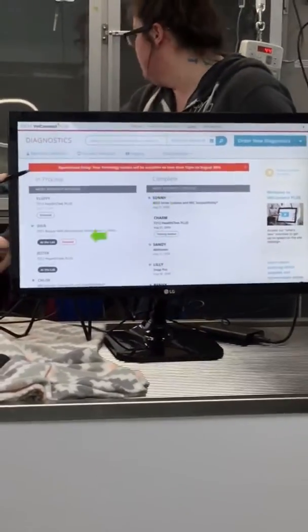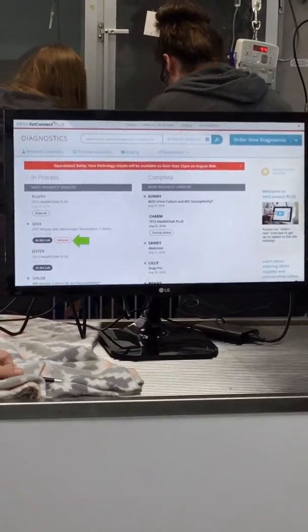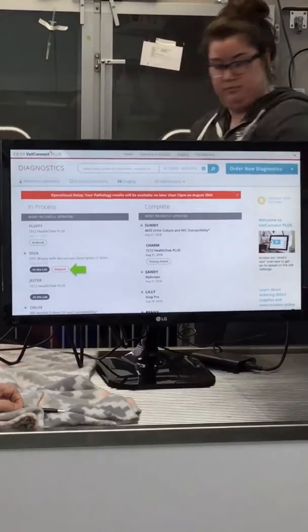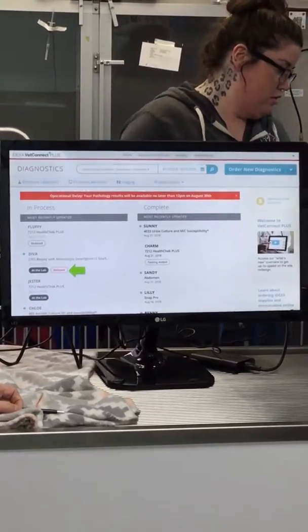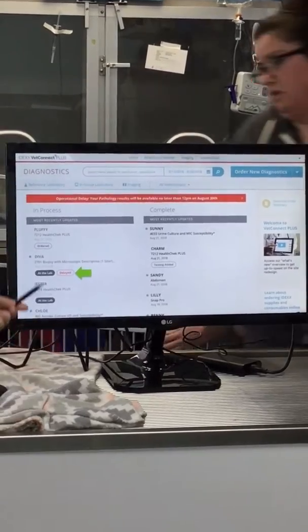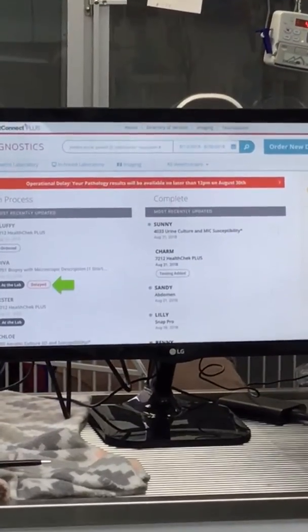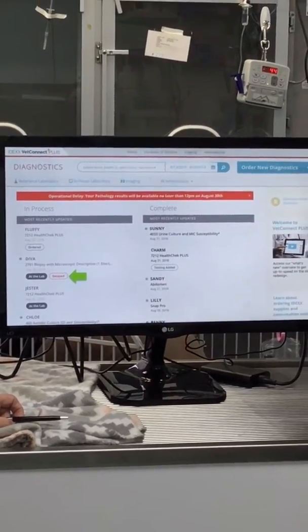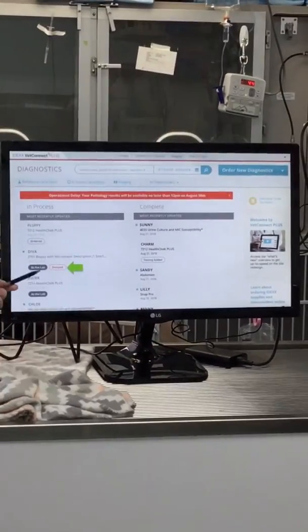It's also cool as you can see any delays. So as we know, in our human world, we have shipping issues, we have storms and all that kind of stuff. So what's nice is it will tell you what your expected turnaround time is and also what specific samples it's affecting. So it's not going to be like all of the labs across the world. It's going to be like a specific one with that specific test.